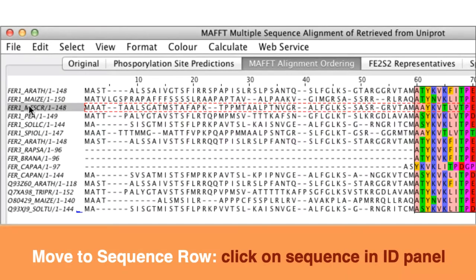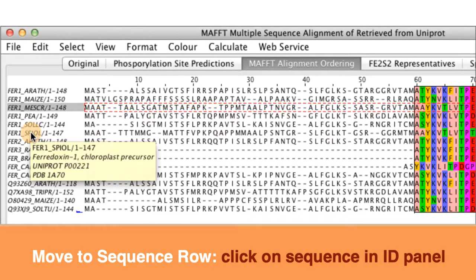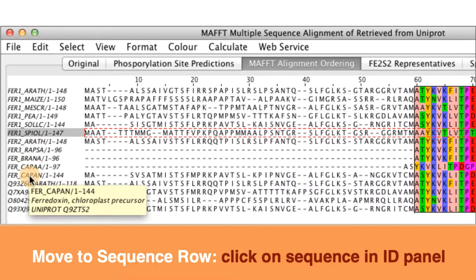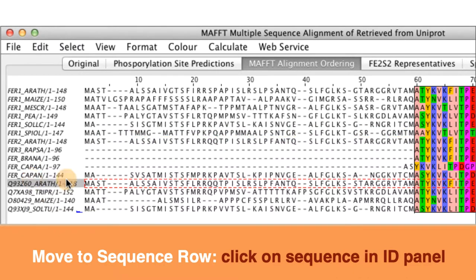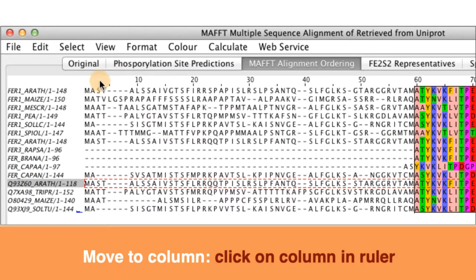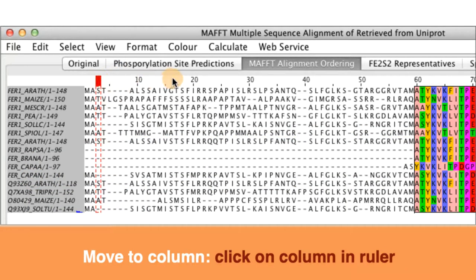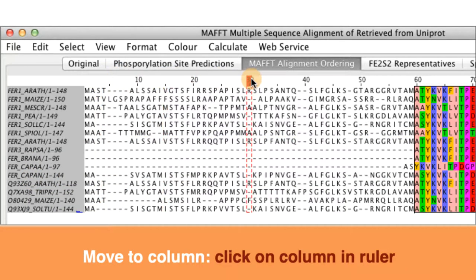You are able to move to precise sequence column or residue in Jalview. In the normal mode to move to a sequence you click on the sequence of interest in the sequence ID panel. To move to a column move the cursor to the column that you are interested in in the alignment ruler.